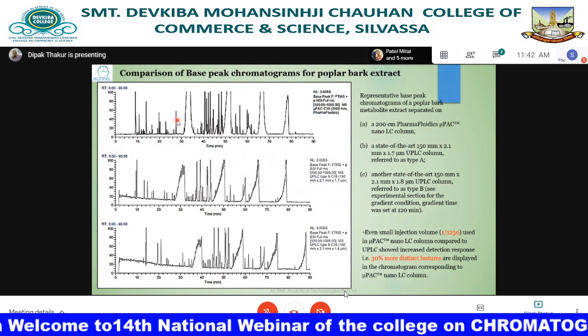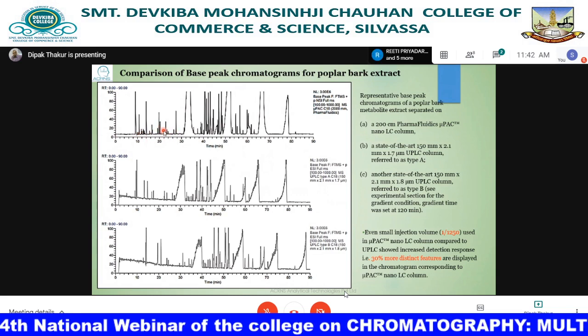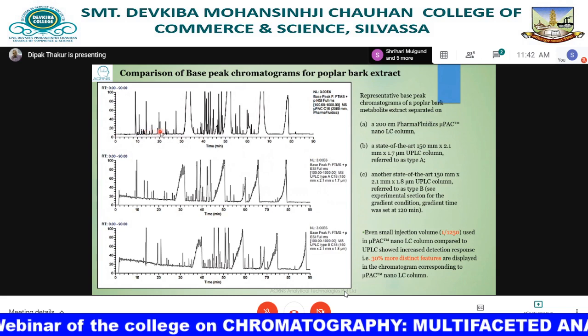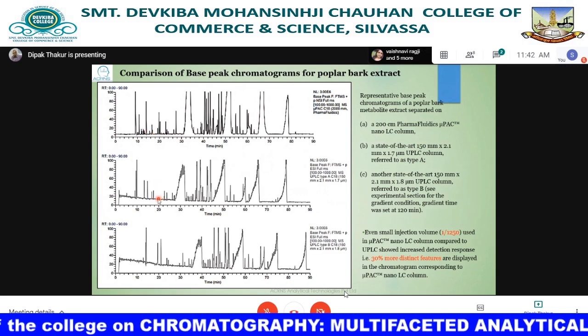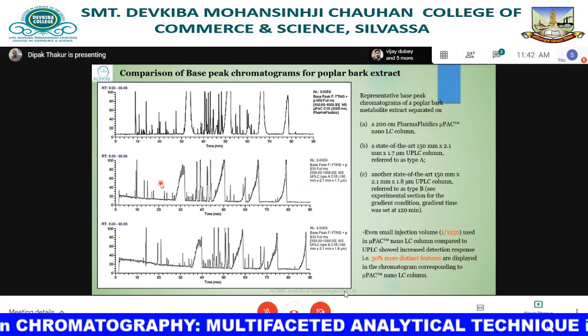And think about it. There are also these compounds, which are low abundant compounds, right? The difference you see here is this is a micropack column, and see the noise level here, these are the packed column and you don't see it. And again, both of these are packed columns and there is no consistency, right?